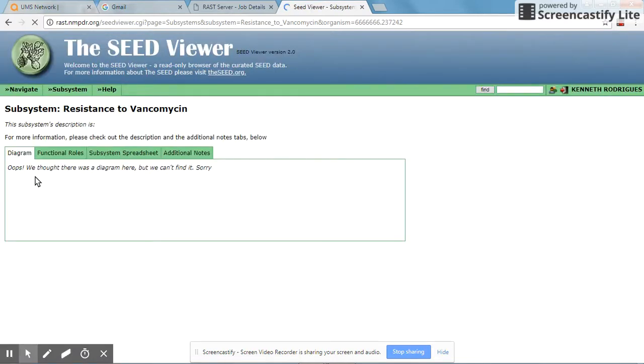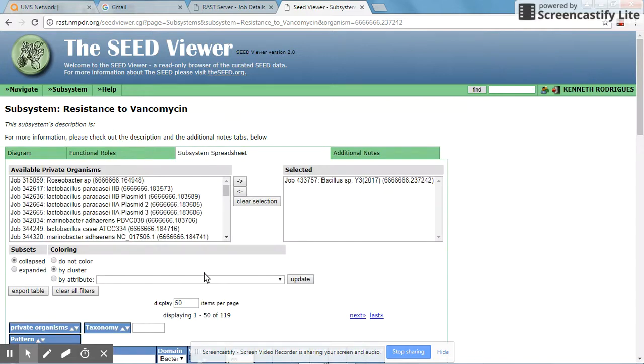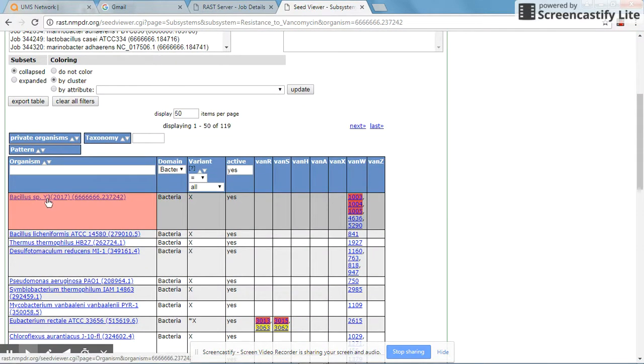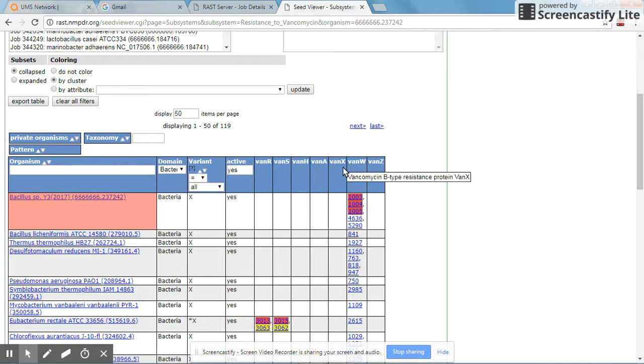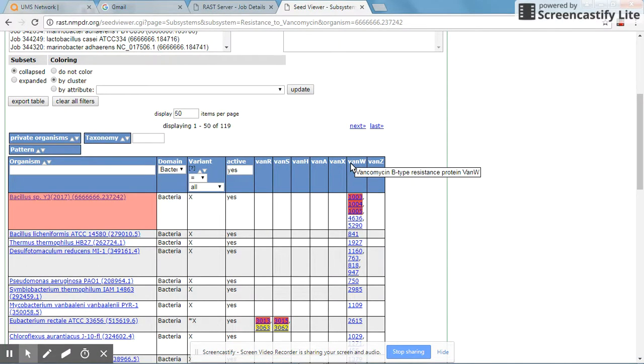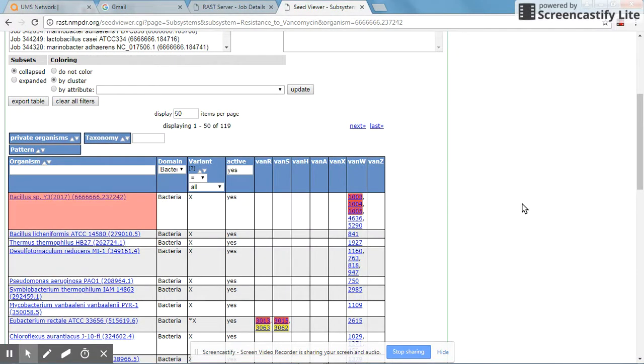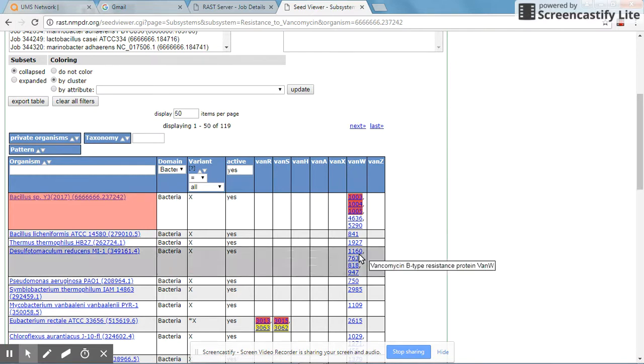To find out the actual gene location, you click on the subsystem spreadsheet. Then you can look at the Bacillus species Y3, which is our target organism. It contains the vancomycin B-type resistance protein, VanW, which is one of the reasons why it may be resistant to vancomycin. However, you still need to validate this by carrying out a lab test.